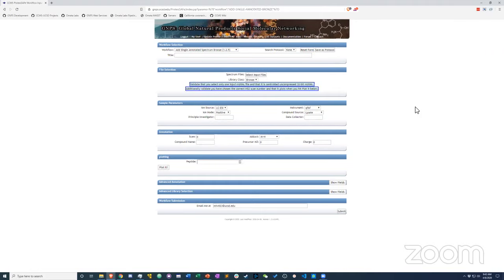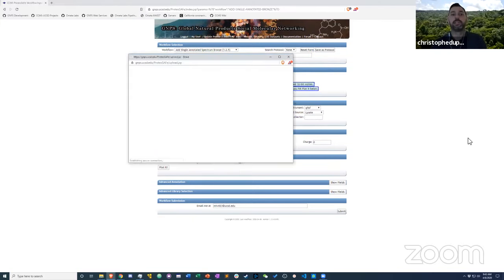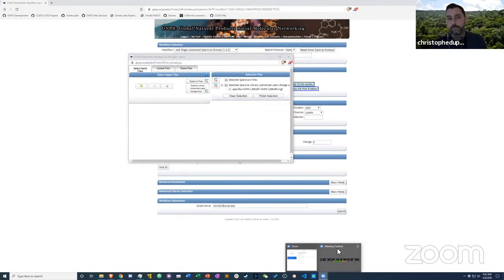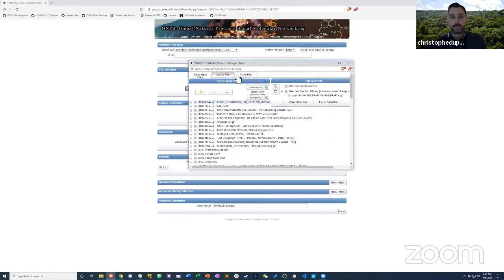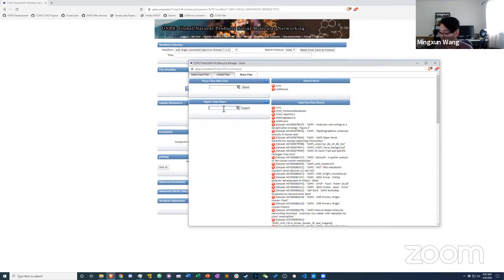Okay, thank you. Ming, yeah, I got a question. It was not very clear to me, when you go to the shared files and you try to type the name of your import data set, is it the name of the folder or the name of the file where the spectra is? When you import, you mean the MSV number, this accession number?